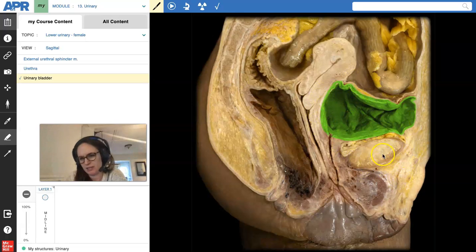So that's actually going to be, I think, the pubic symphysis right there. And that's going to be the uterus. So it's actually pretty typical. What you got going there? She's got a little, is that a fibroid? Might be a fibroid. Something's going on right there. It's not supposed to be there. Okay, she's got a little tilted uterus, which is very typical. That uterus tends to tilt one way or the other. It's not typical for it to be oriented perfectly in alignment with the vagina. It's pretty typical. Okay.